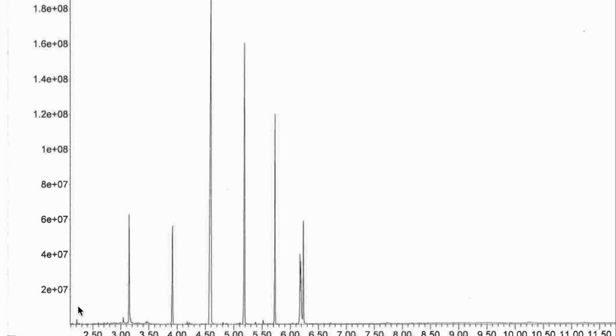So every second or couple times a second, it is scanning for the number of ions hitting the detector. The mass spec itself is the detector. And so when there's not much happening, there's not a lot of ions, but when something does come off of the GC column, we do see a spike, an increase in the abundance of ions hitting the detector.